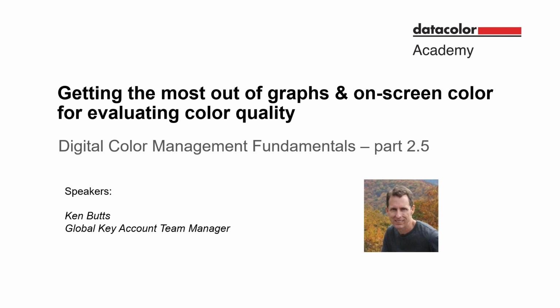Thanks, Chen, and again, welcome everyone. It's a pleasure to be back with you. Hopefully you've had an opportunity to review the 2 sessions we've recorded so far using Datacolor TOOLS software. This is a continuation of those sessions.